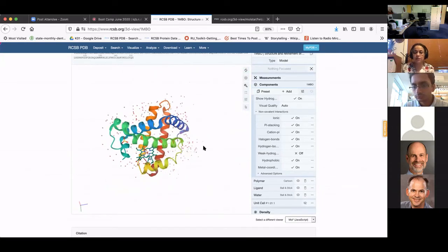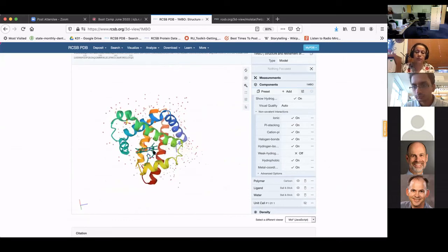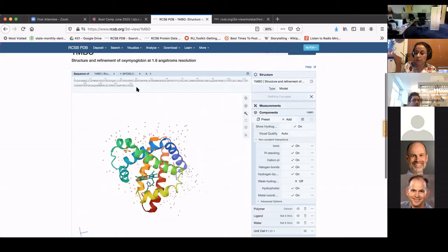So this is if I can clearly see what the ligand is or which amino acid I want to click on. But what if I'm reading a paper and in the paper it says, residue number 60 has some interesting interaction. So how would I get to that? So for that, I think using the sequence panel makes it easier.